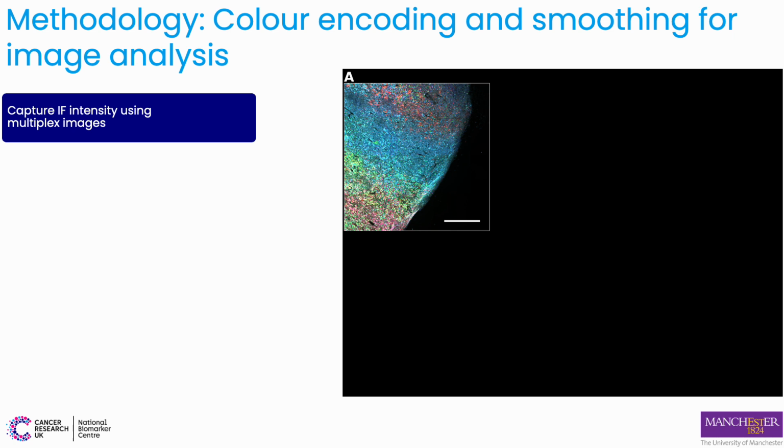Now, although the color of the tumor is quite visible under the microscope, there is a computational challenge in converting this visual information into quantitative data for analysis. For example, the color intensity of the tumors may be affected not just by the clonality, but also the staining of fluorescence and the measurements from the microscope. Also, as the colors were introduced at a random level, it is quite difficult to accurately infer the number of unique clones from the colors, as the resulting colors exist in a spectrum of colors.